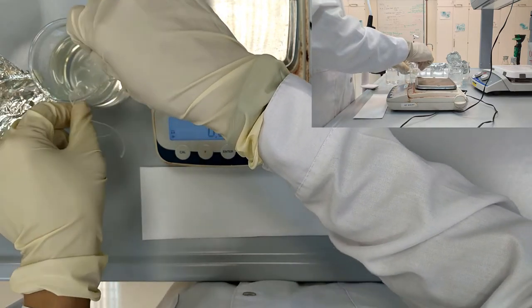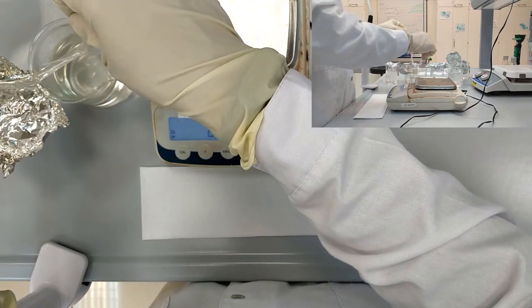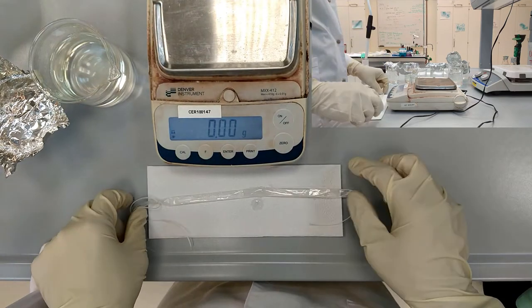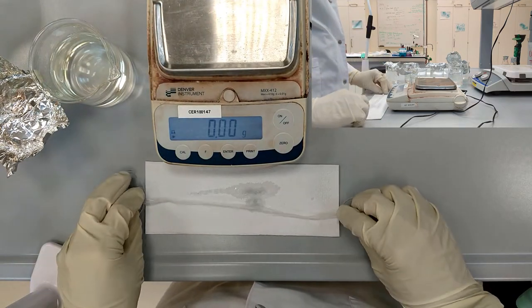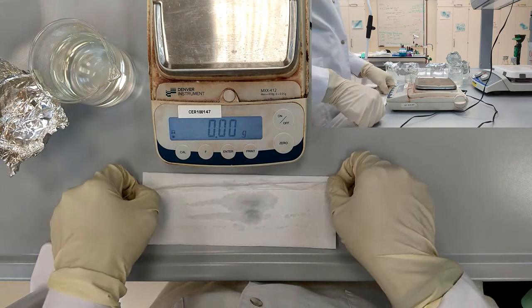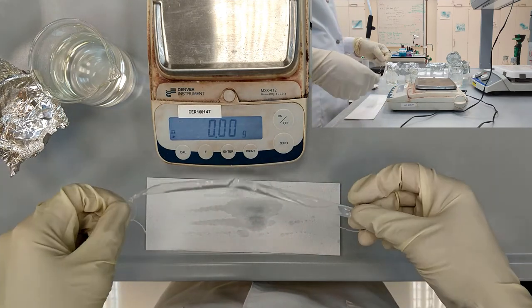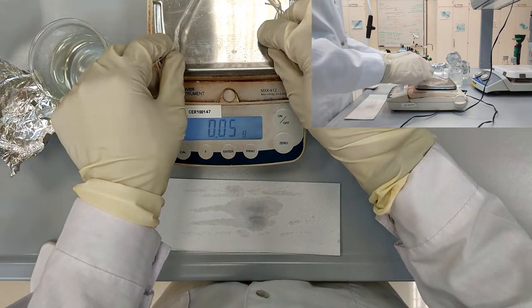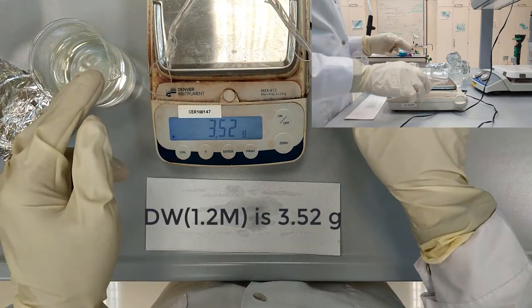We need to determine the mass of the dialysis tube that was placed in the 1.2 molar glucose. We dry it and place it on the scales, so the mass is 3.52 grams.